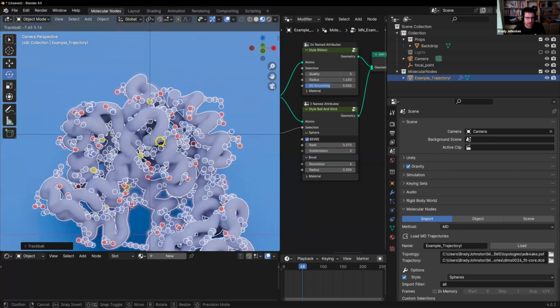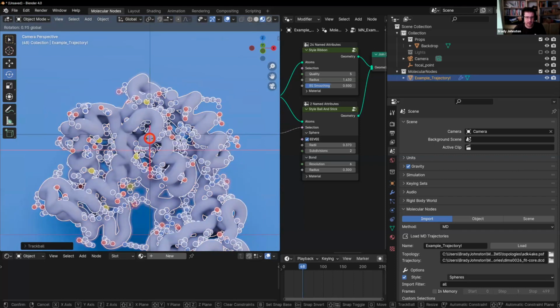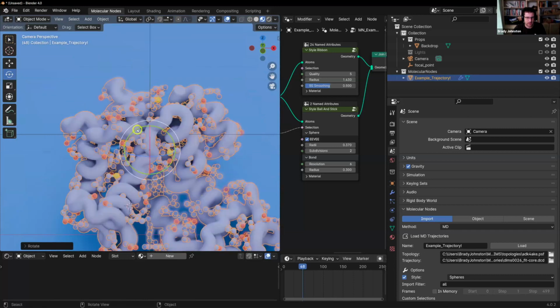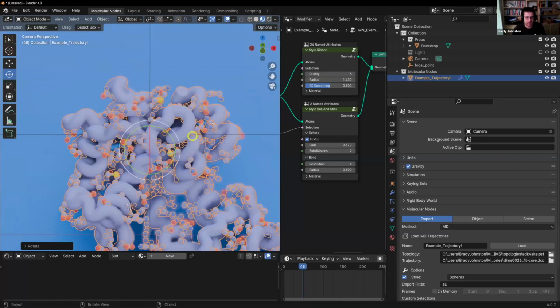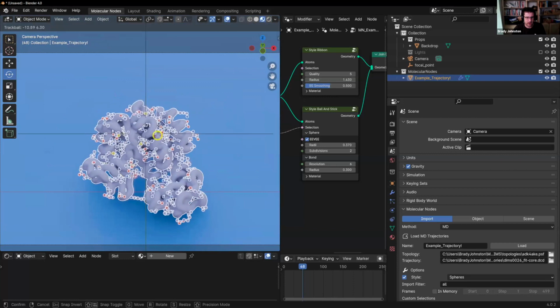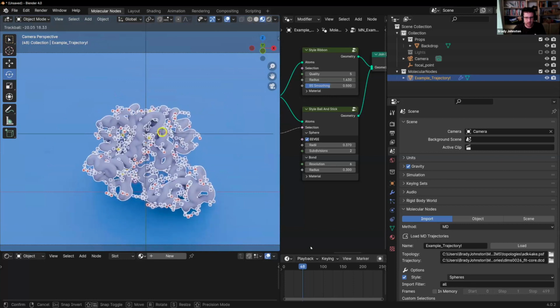And we can see, if I click on just the red, it'll go just on that axis, the x-axis, or that axis, or that axis. I'm just going to Control Z to undo some of those, but I rotate it around and say, okay, that's what I want facing me.